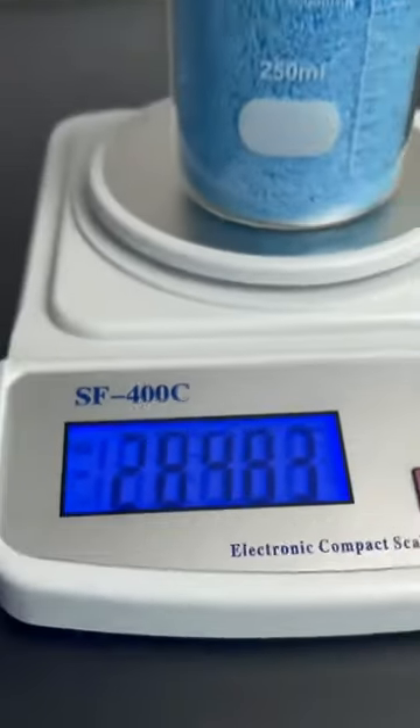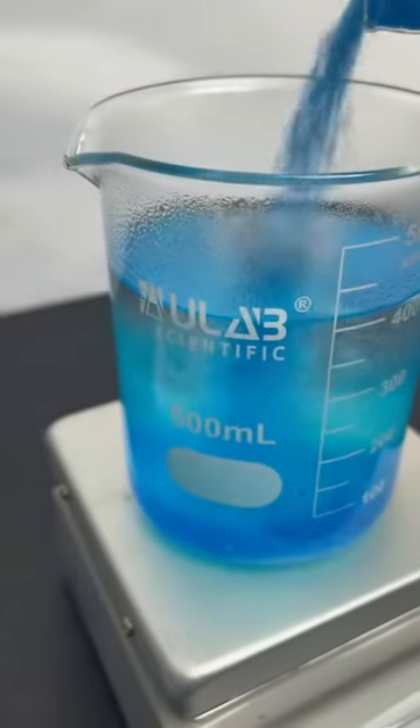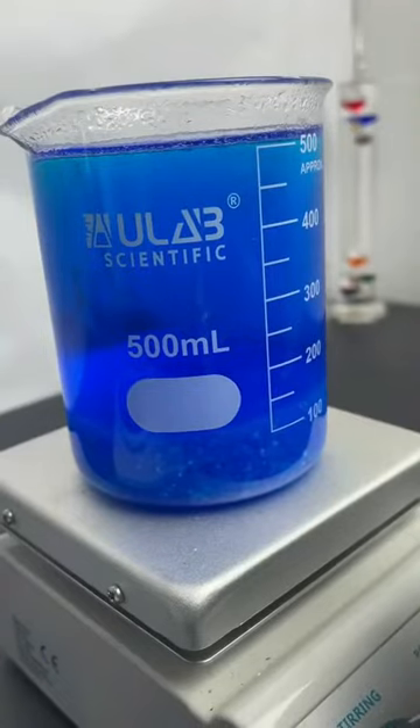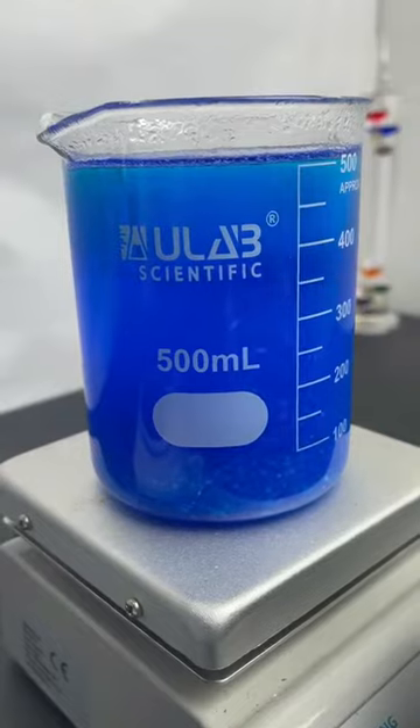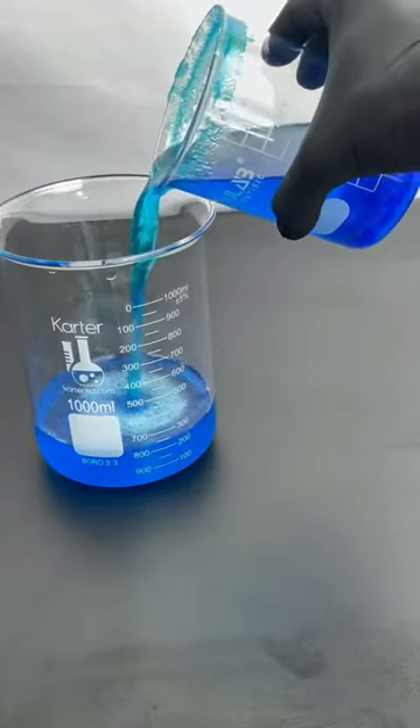This is copper sulfate pentahydrate. The pentahydrate part just means that it has five water molecules in its structure. And if you remove these, it'll lose its blue color and turn gray.